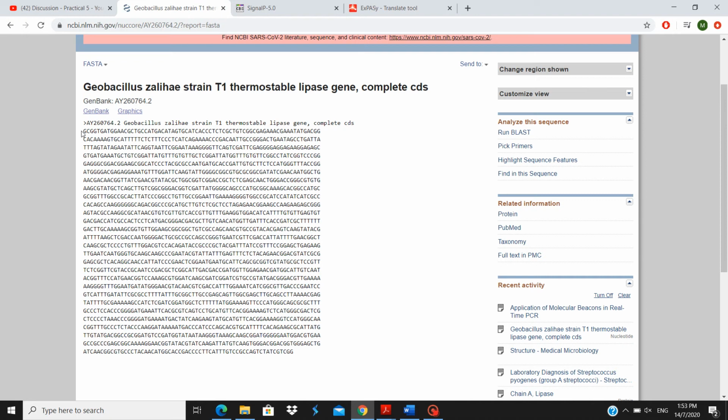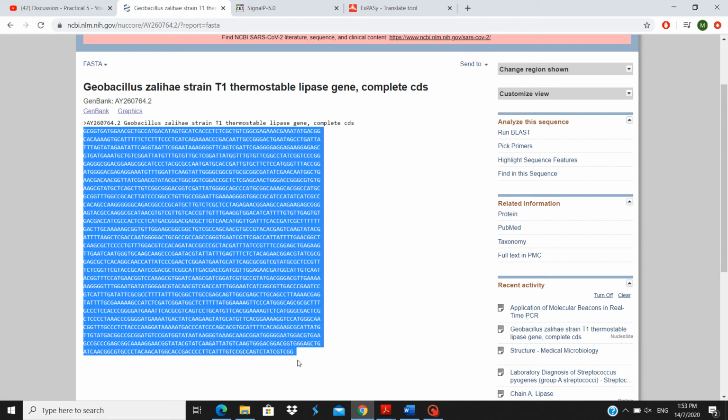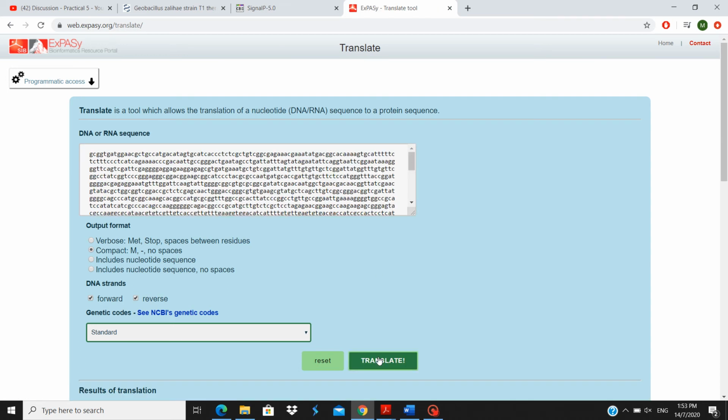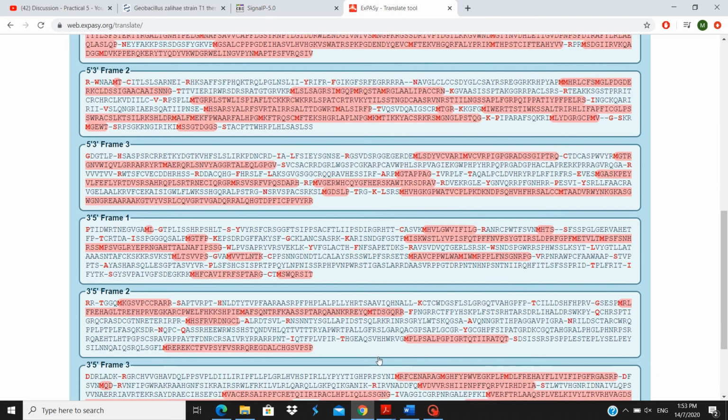I will copy, paste, and translate. Then this is the result that we get.